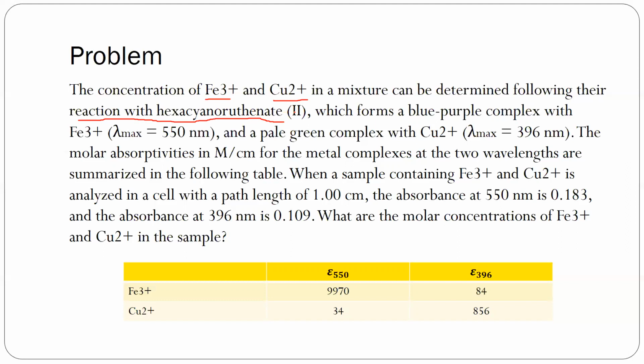Usually, ang molecules mo, makakapag-absorb lang siya ng UV or visible radiation kapag meron siyang tinatawag na chromophore. Okay? Chromophore. Ang ibig sabihin ng chromophore kasi, structure siya kung saan may makikita kang conjugated double bond. So pag may double bond ka na alternating, imagine nyo yung benzene for example. Okay? Benzene. Conjugated double bond ang tawag dyan kasi alternating yung placement ng double bond. Okay? That's why benzene is active when it comes to UV or visible radiation.